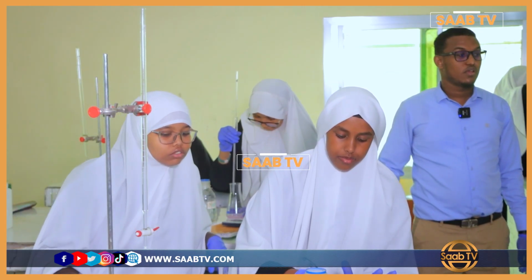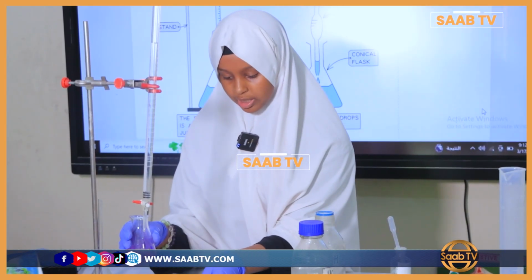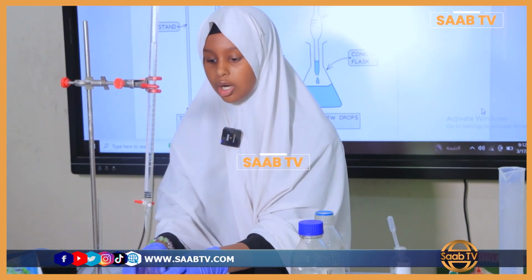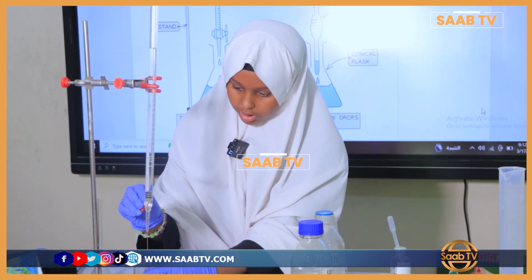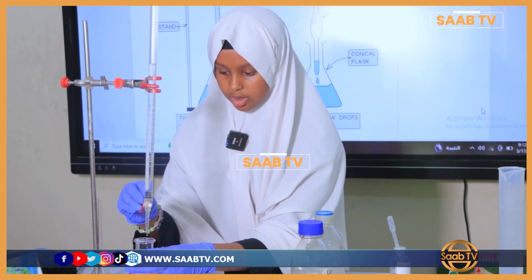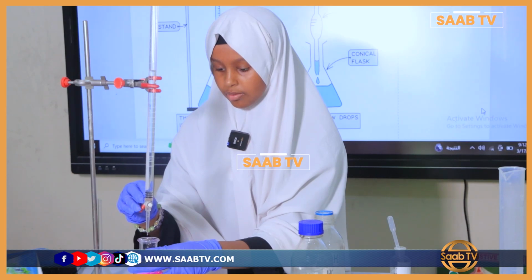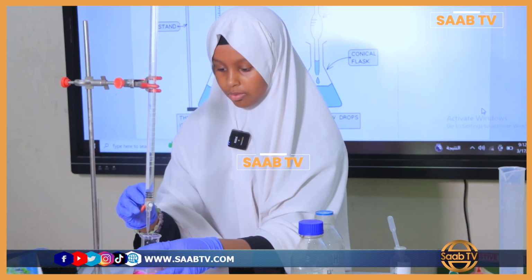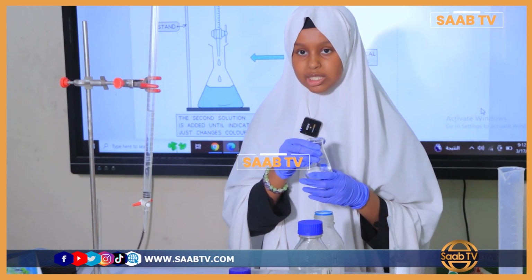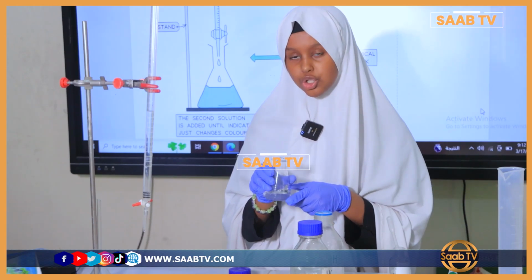Now we're going to use the burette filled with the hydrochloric acid, and put the flask underneath. The reason we have paper underneath is so that we can clearly tell when it's neutralized, because it will turn colorless when it becomes neutralized. With one hand you open this, and with the other hand you shake this. When you see it clearly changing color, you go drop by drop, but ours has already changed color. You can see that it's now colorless, which means it's completely neutralized.